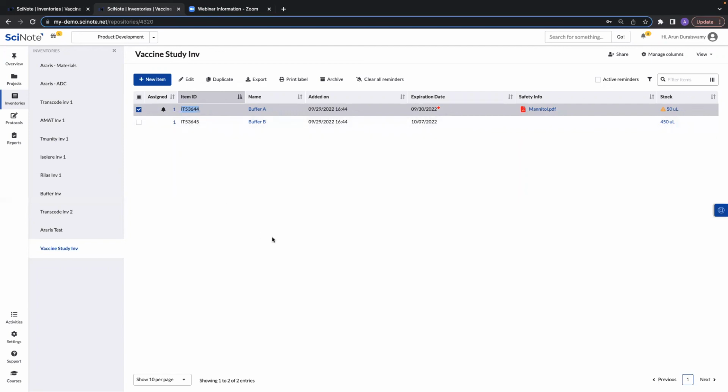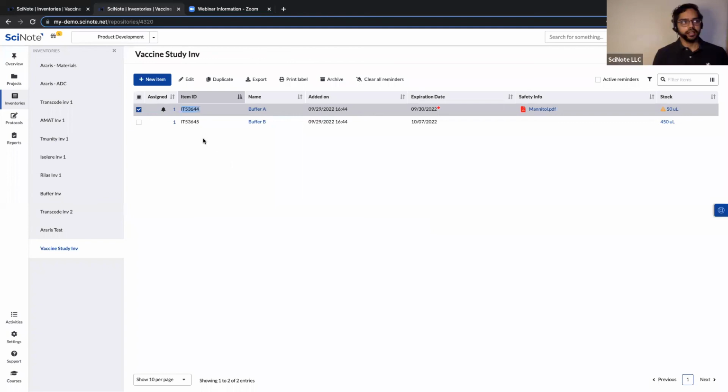Okay, so I hope that answers your question. Do you have something to add there, Arun? Sorry, Kelly, what did you say? I said, I thought you were going to add something there. Oh, no. I think that covered it. The inventory item IDs are unique for each new item that's added.